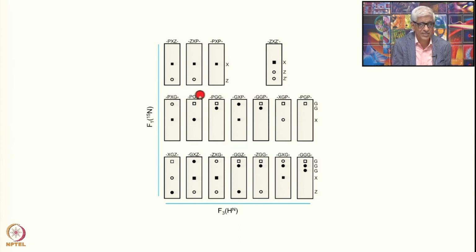If it is PGX, that means the glycine in the middle, then you will have the square which is on the top, but this will have a negative sign. See, unlike this X which has a positive sign, the glycine self peak will have a negative sign, and you see everywhere where there is a glycine in the middle, it has a negative sign, and this is an extremely useful factor because you immediately figure out where you are along the polypeptide chain.